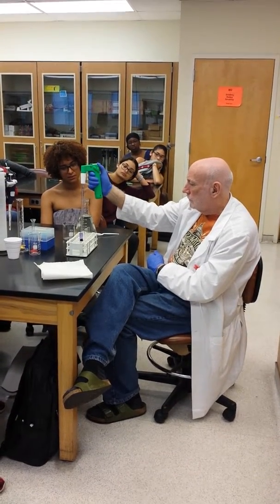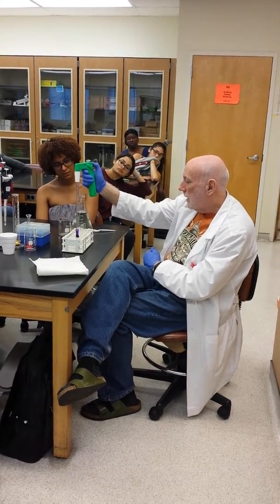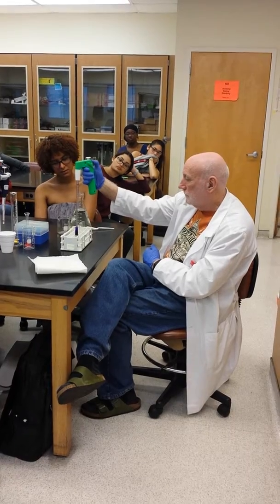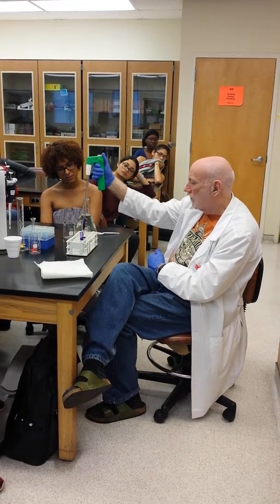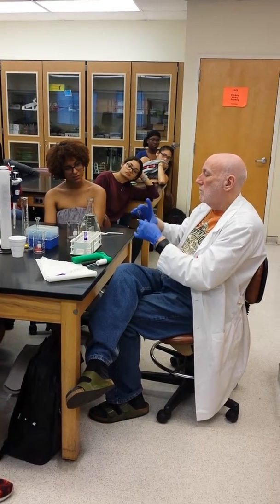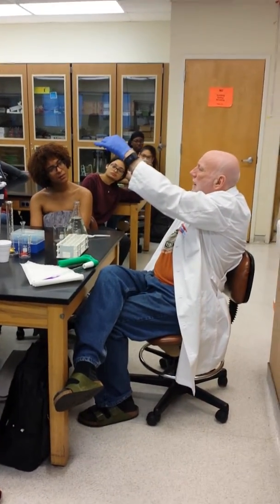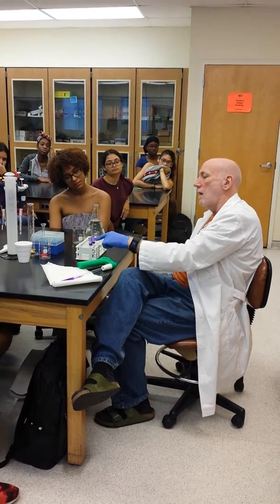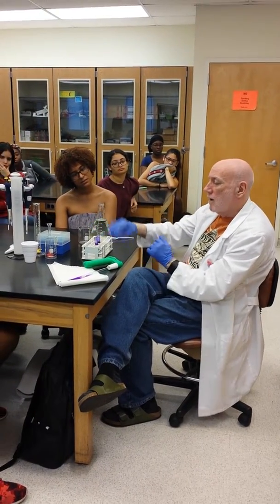Watch, I'm going to take 1 milliliter out of this purple stuff, and listen carefully. I'm going to put it into 9 milliliters of water, not millimeters, but milliliters. See any difference yet? This is 10% of this. So I took 1 milliliter here and put it into here. Now I have a 0.1 molar. And you don't see much difference yet.